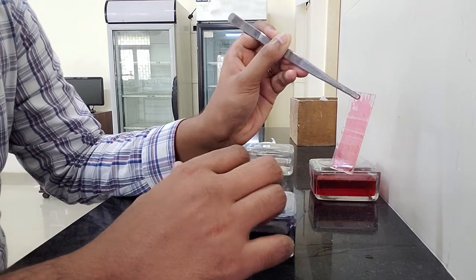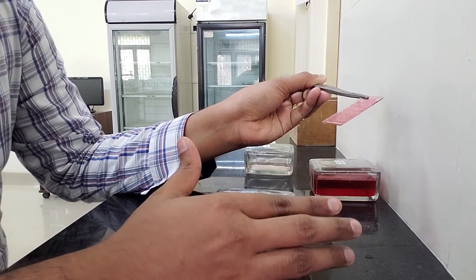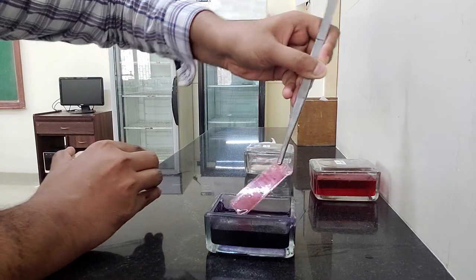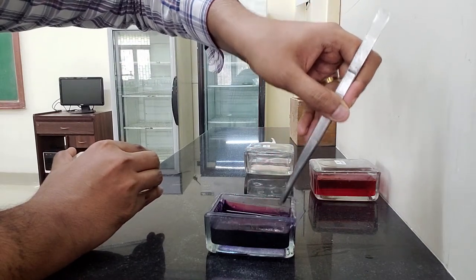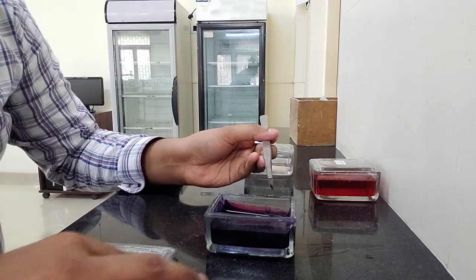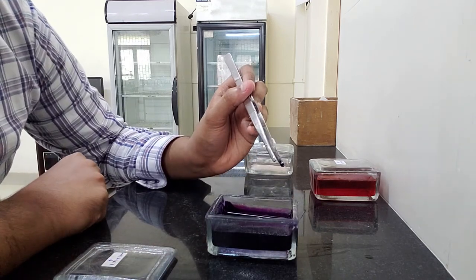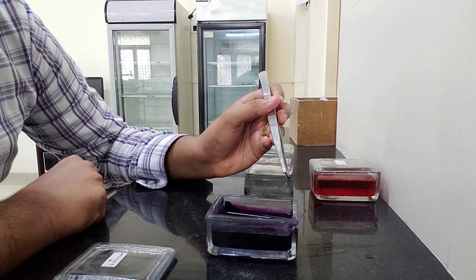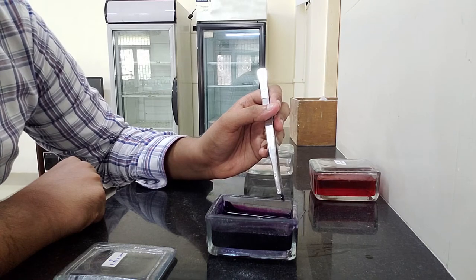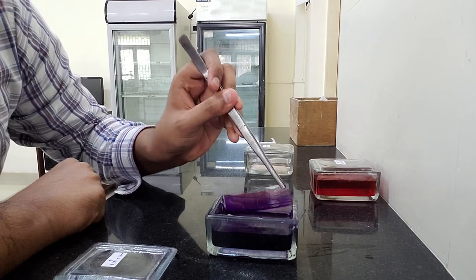The slide is a little wet, so you can wait for some time and then you can put it in Field stain A. In Field stain A we are going to keep the slide for around 10 seconds. I'm going to open it and dip it into Field stain A, and gently see to it that it covers my entire slide and start counting till 10.